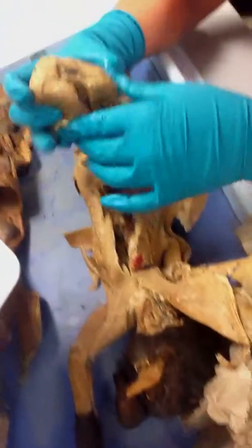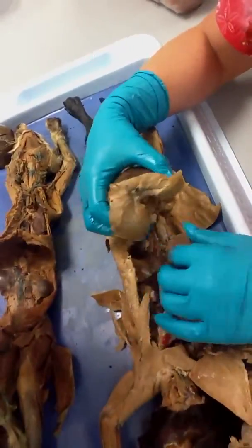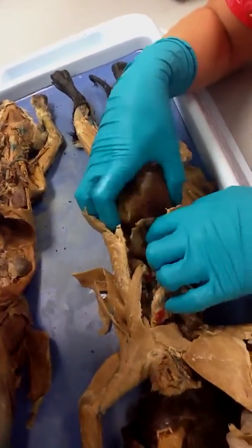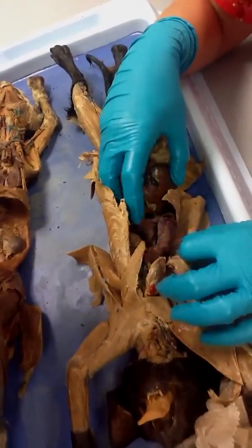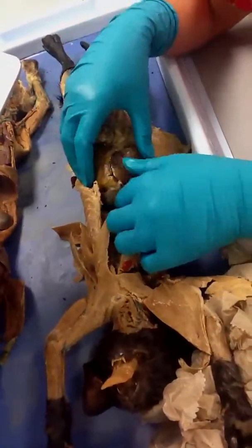Okay, this is part of the diaphragm. You can see the striations because it's muscle, right? They're going to be contracting along here and movement to help pull the lungs down, the chest cavity down, so the lungs can expand into the dead space that's in the pleural cavity.